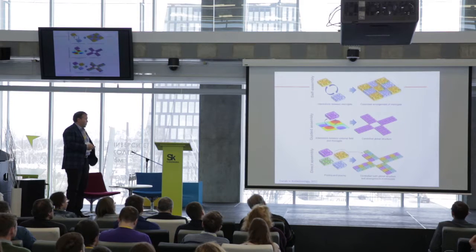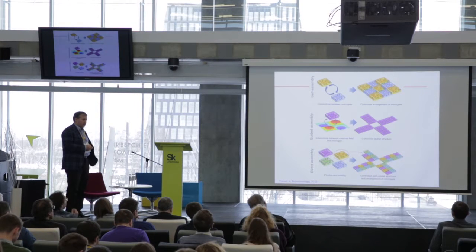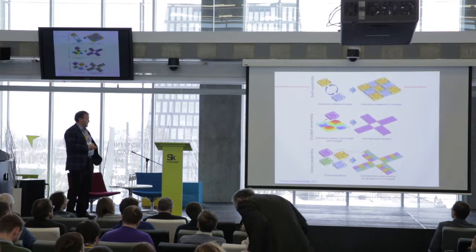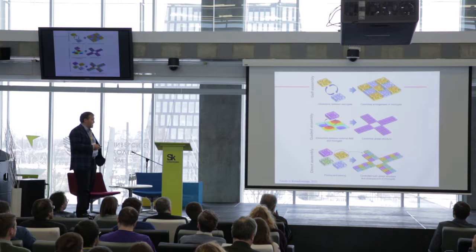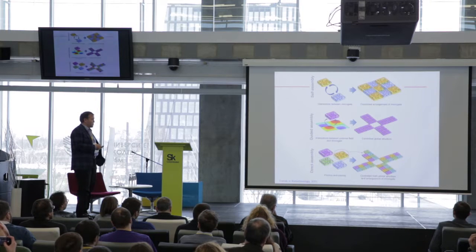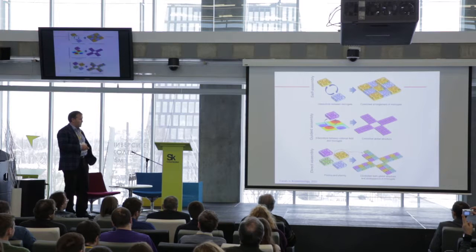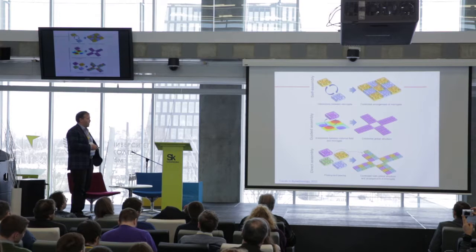Over the years, people started thinking about self-assembly, especially at the nanoscale. Self-assembly is what dominates in cells, in microscale. But when you start looking at spheroids, like micro-scale objects, then assembly dynamics change. So self-assembly becomes harder if you are going to try to control patterns. Therefore, we have been thinking over the years about how we can apply forces and methods to actually control how we assemble things.